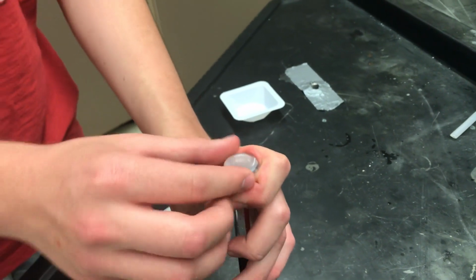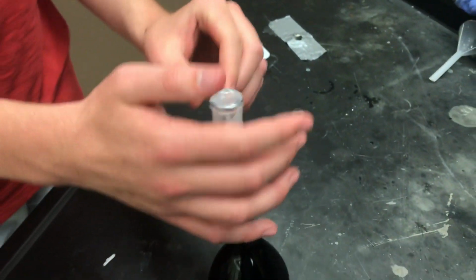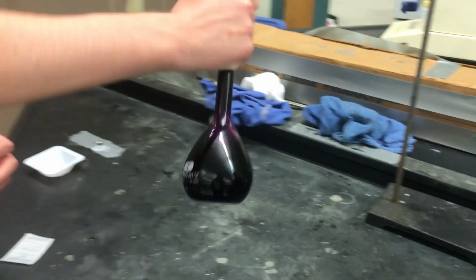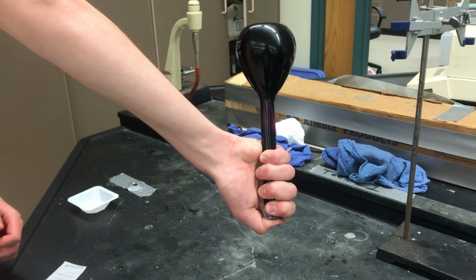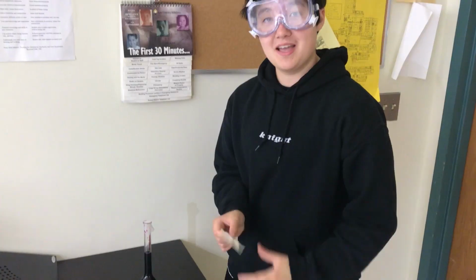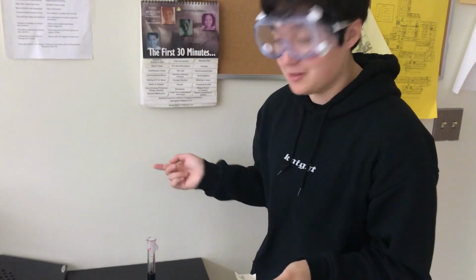In order to stir the solution, we're going to put our thumb on the top and flip it upside down, back over a couple times. You gotta be sure to label your solution so you know who it belongs to and what's in it.